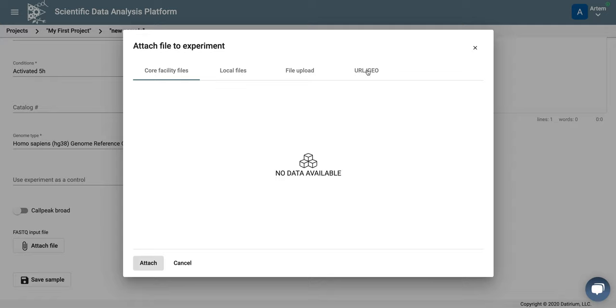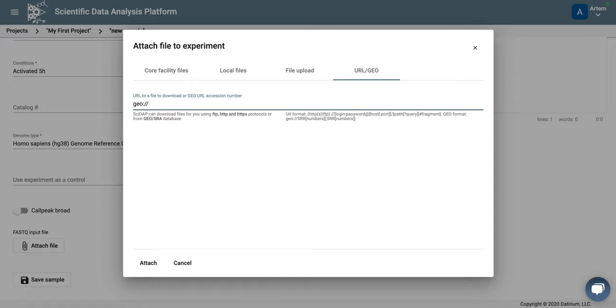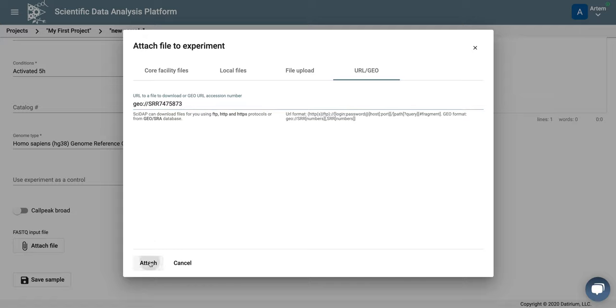So the data are from GEO, so we put GEO and SRR number. If there is more than one SRR number, then they can be separated by comma. And click attach.